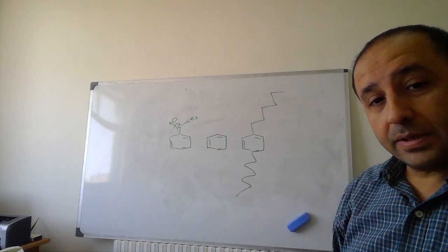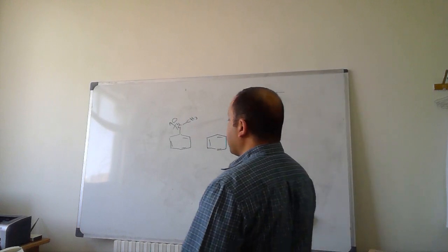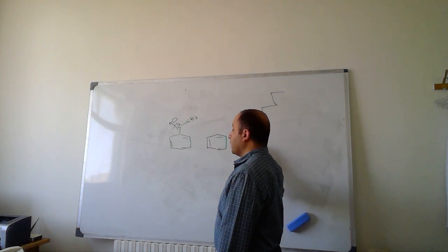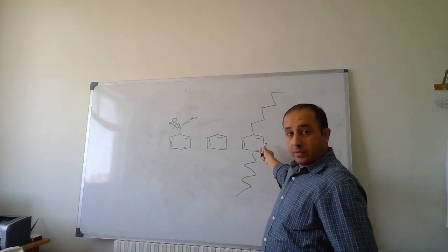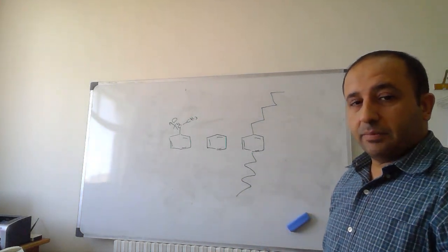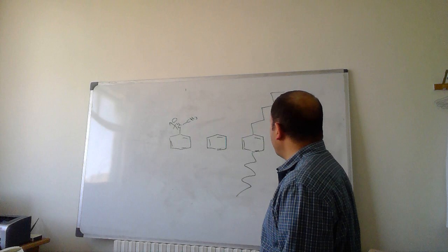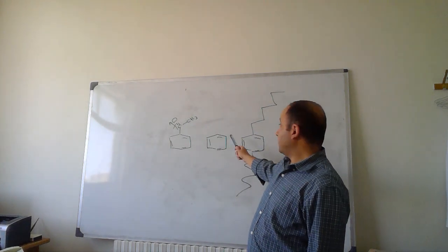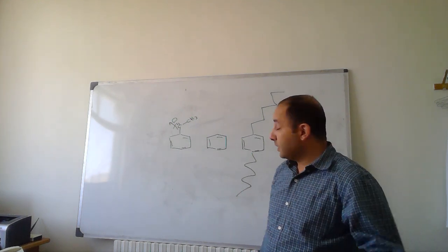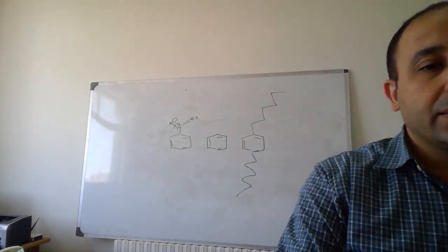But obviously, these two molecules are close in molecular weight, although this molecule has a real difference in molecular weight, so we cannot apply size exclusion. If we have just these two, we might apply size exclusion, particularly by using a suitable pore size. But with this one, it is difficult to get all the compounds separated.